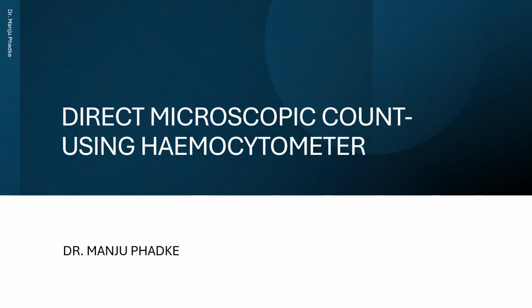This episode is based on some practical aspects of microbiology. In this episode, we will be studying the direct microscopic count, which is a rapid method to count the bacterial cells in both stained as well as unstained preparations.